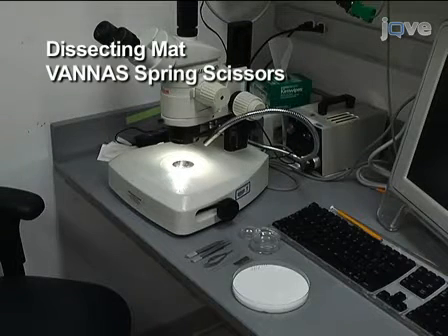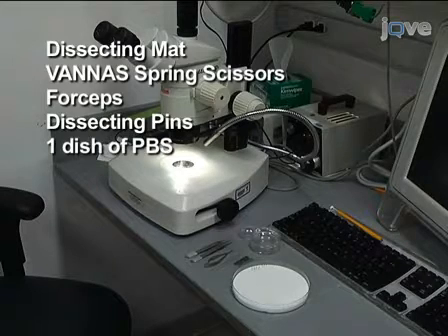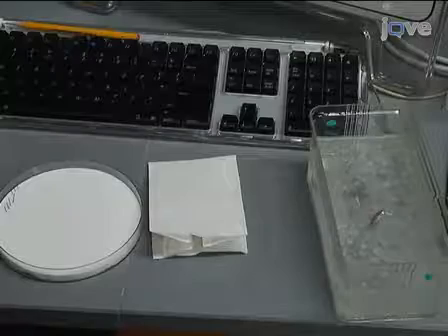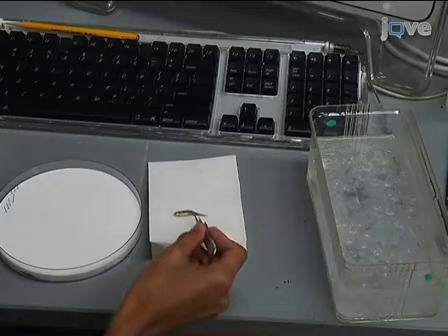You will need a dissecting mat, Vannas spring scissors, forceps, dissecting pins, a dish of PBS, and a fish that has been anesthetized and euthanized. Lightly pat the fish dry on a paper towel and place it on its side on a dissecting mat.